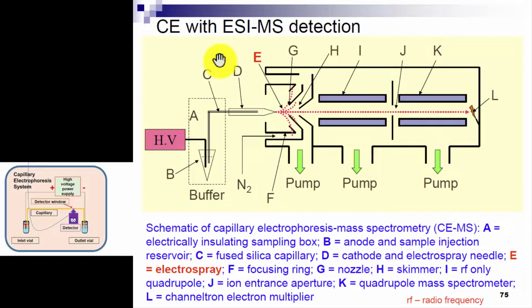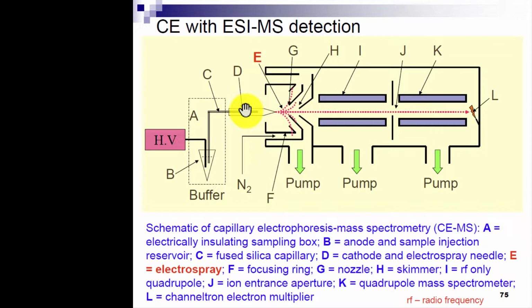Here, ESI takes place under atmospheric pressure and temperature in this apparatus. The sample solution is pumped through a stainless steel capillary needle at a rate of a few microliters per minute, and the needle is maintained at several kilovolts with respect to the cylindrical electrode that surrounds the needle. Then the resulting charged spray of fine droplets passes through a desolvating capillary, where evaporation of the solvent and attachment of charge to the analyte molecule takes place.